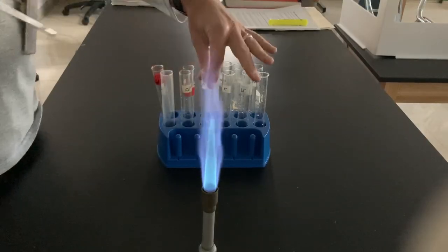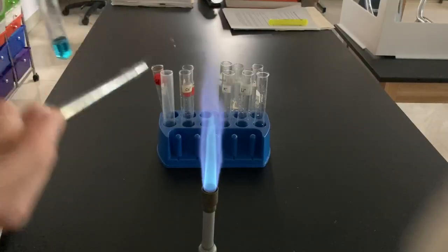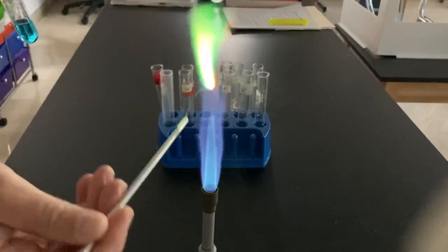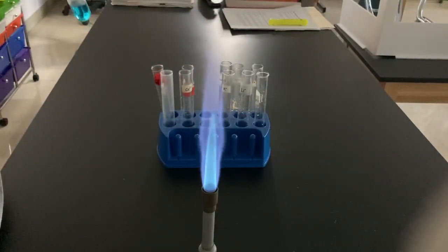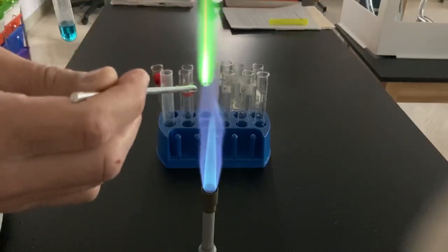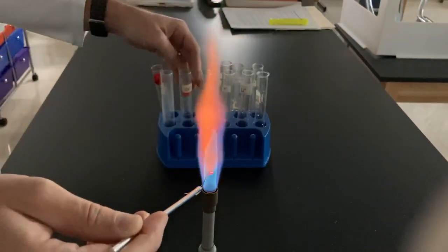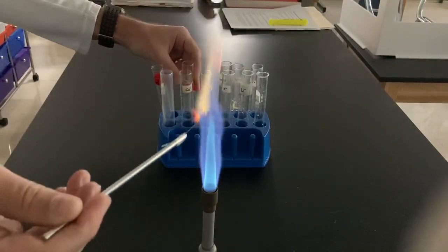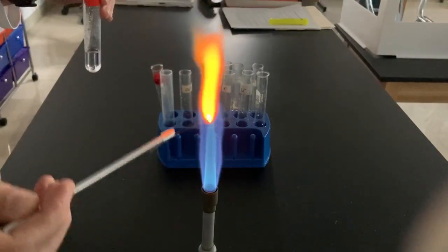Next up is copper. Very distinctive green there for copper. I'll show that again. Yeah, copper is easy to see. I'm going to use that nitric acid to clean off my nichrome wire, make sure it's all good. We still got some copper on there, so I should probably clean that again.